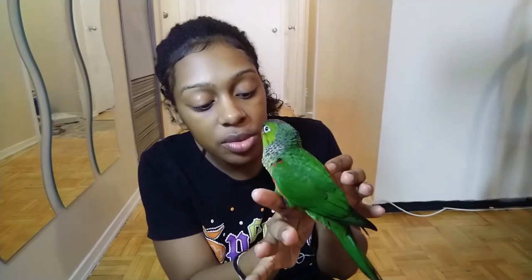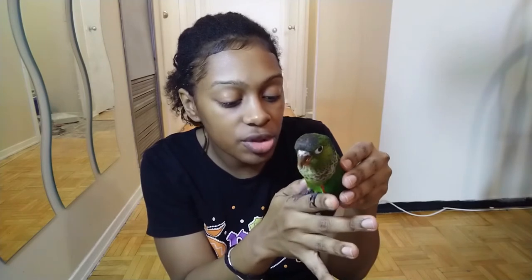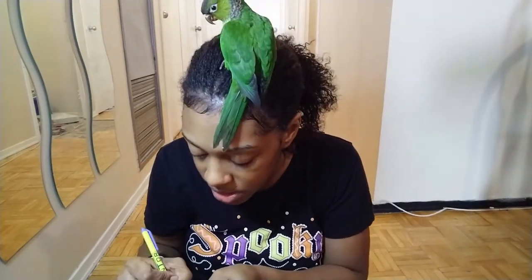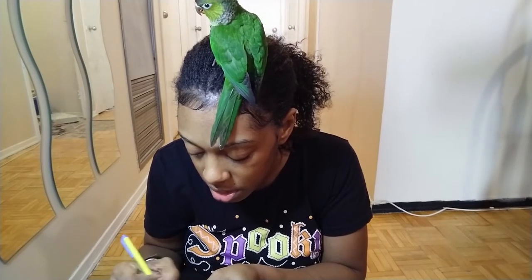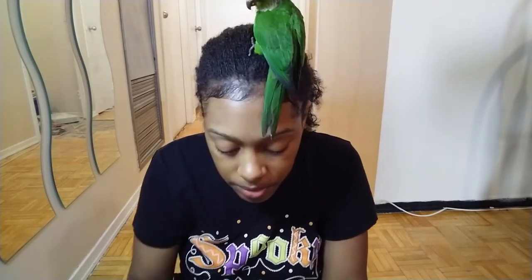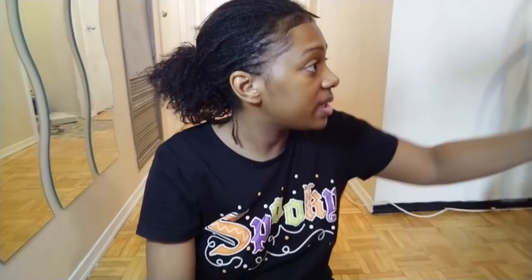Step up. There you go. I did teach baby to step up before he goes home. I'm going to fill in the ID number. Let me sterilize the nail clipper — I use a baby nail clipper. So it's all ready.